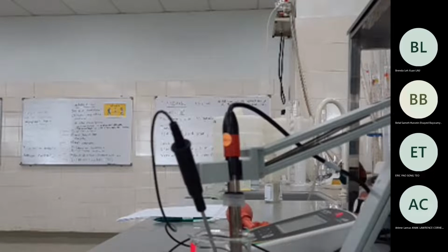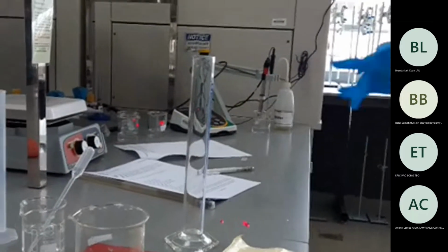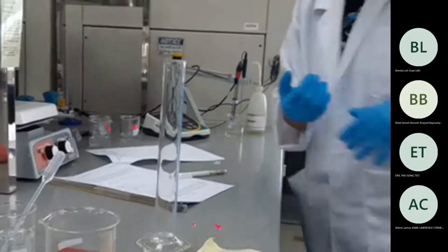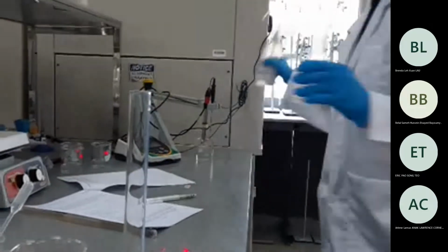Have you taken the 50 milliliter of one? Yes, put it here in the beaker. No need to label, right? No need, because this is the only buffer solution that you have. Let me show you to your friends. Eric is waiting there. Vanessa is preparing the buffer solution. She just put 50 milliliter of what? Sodium acetate she put, and then she will put another what? Yep. So that is in your fume hood where? Use the same one, right? Same one, yeah, better.